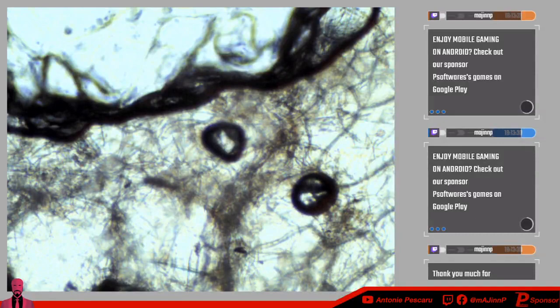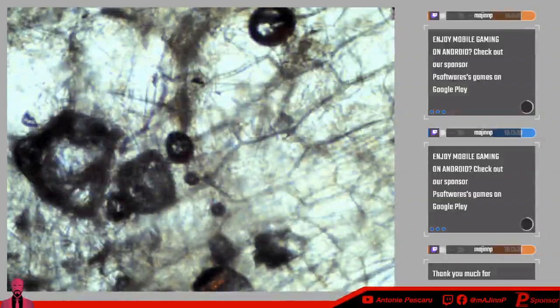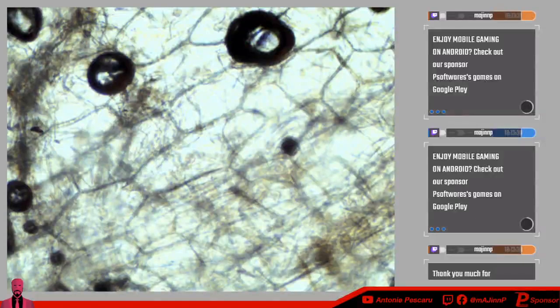All right, so what we're looking at here is our plant cell. In this case, I have chosen an onion. The reason for that is because they're very easy to look at, and they're really easy to strip off, essentially. So what we're looking at is tons of them. As you can see, there's tons of cells bunched up together. I just centered one of them right now, and it's right over here. This one in the middle right here.